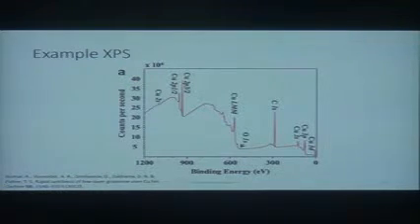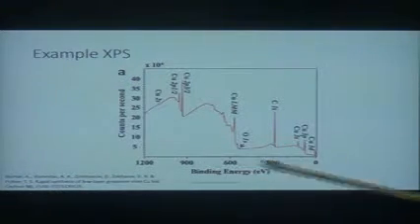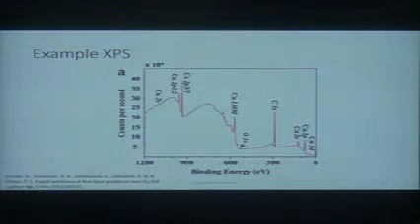And here you're going to see, again, I told you we grew the graphene on copper, which is very common to do. We kept the copper in this sample, and you'll see that this binding energy curve is given. So the spectrum is given. A lot of times, one of the confusing things about XPS is that you think that the people who do XPS may be dyslexic. I don't know if you know what that is.